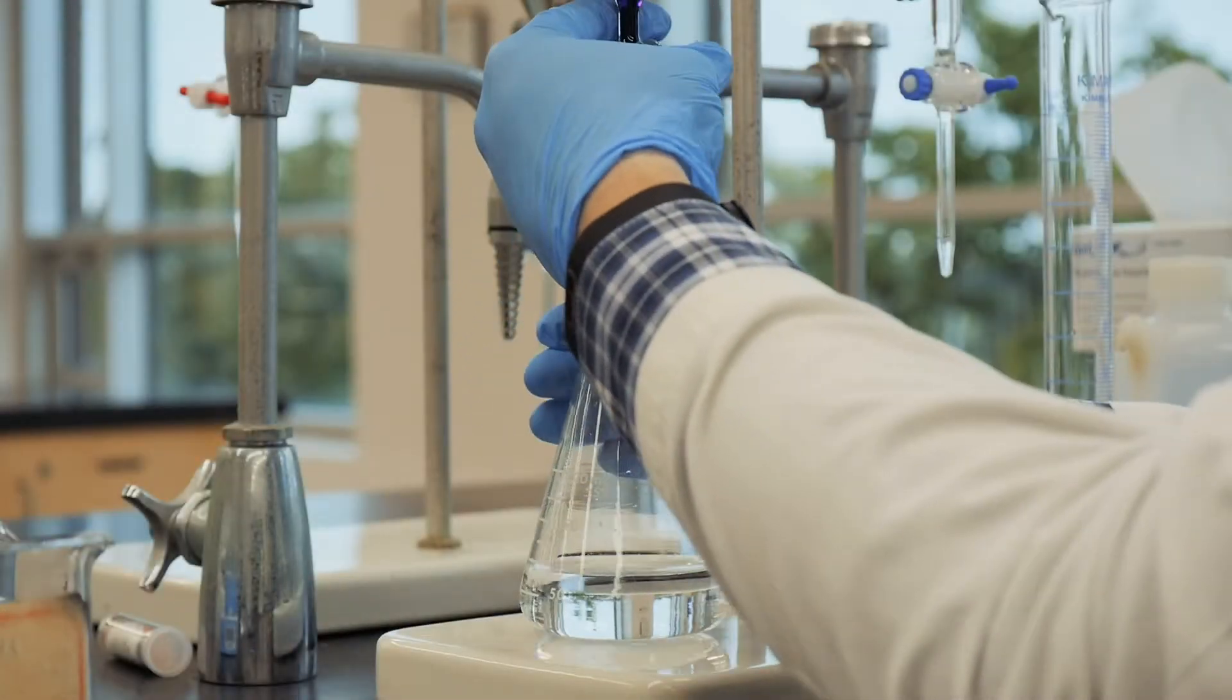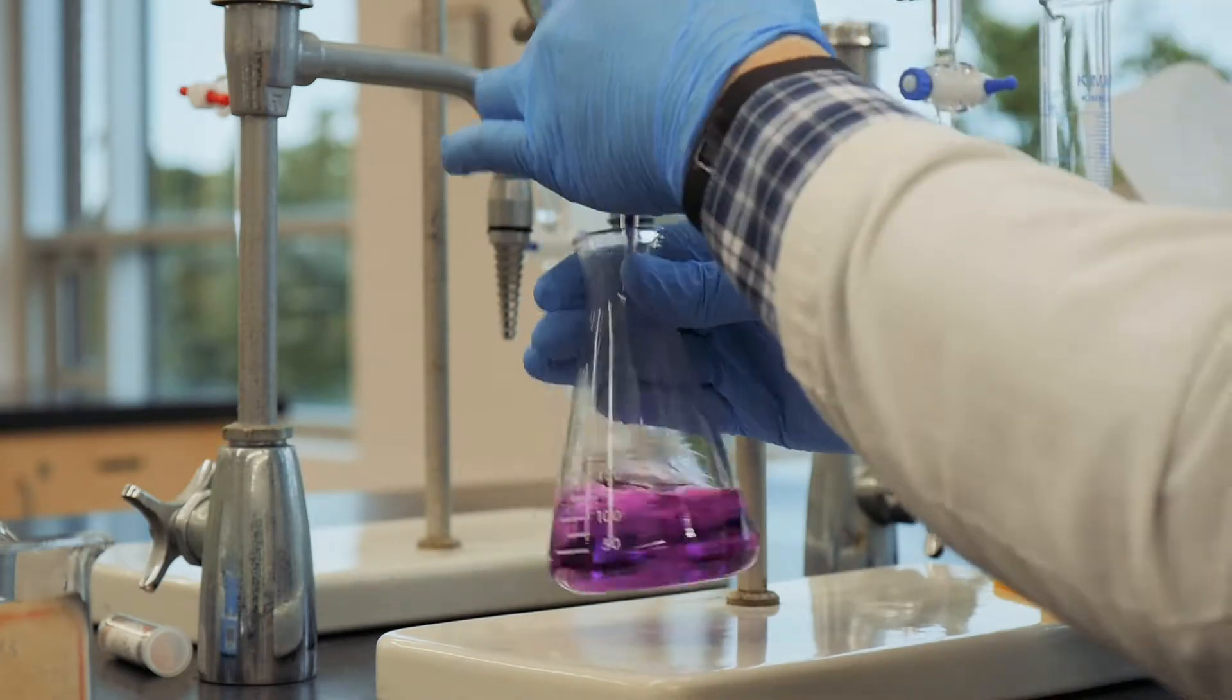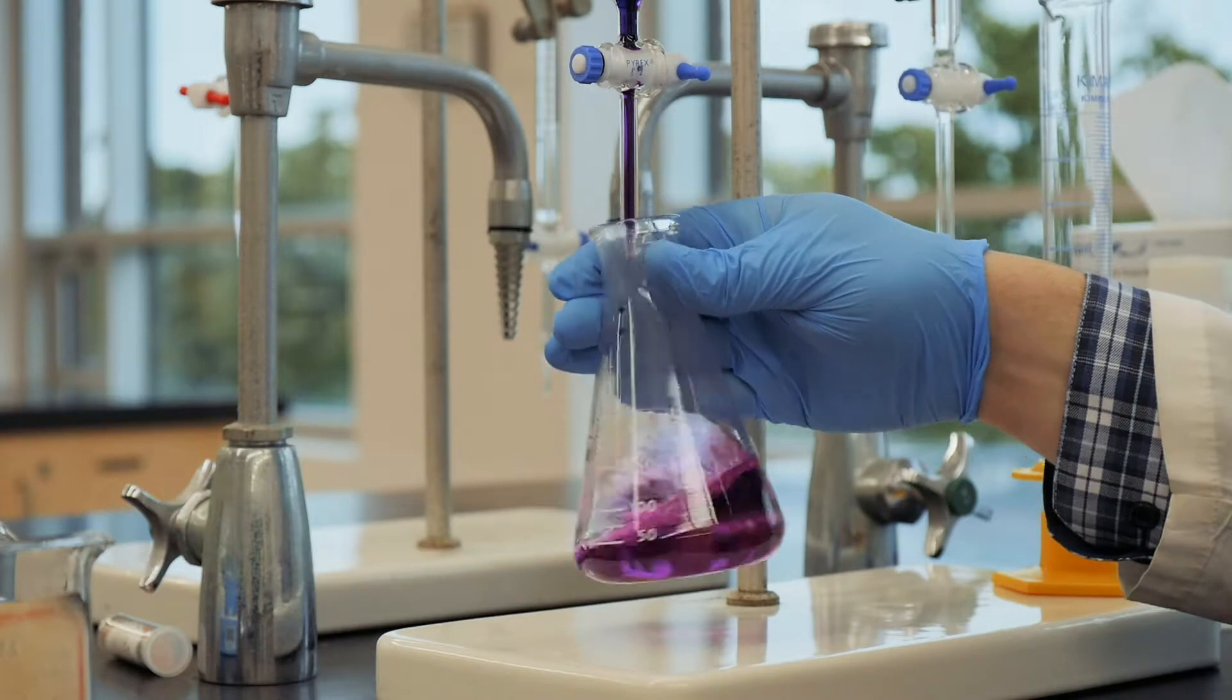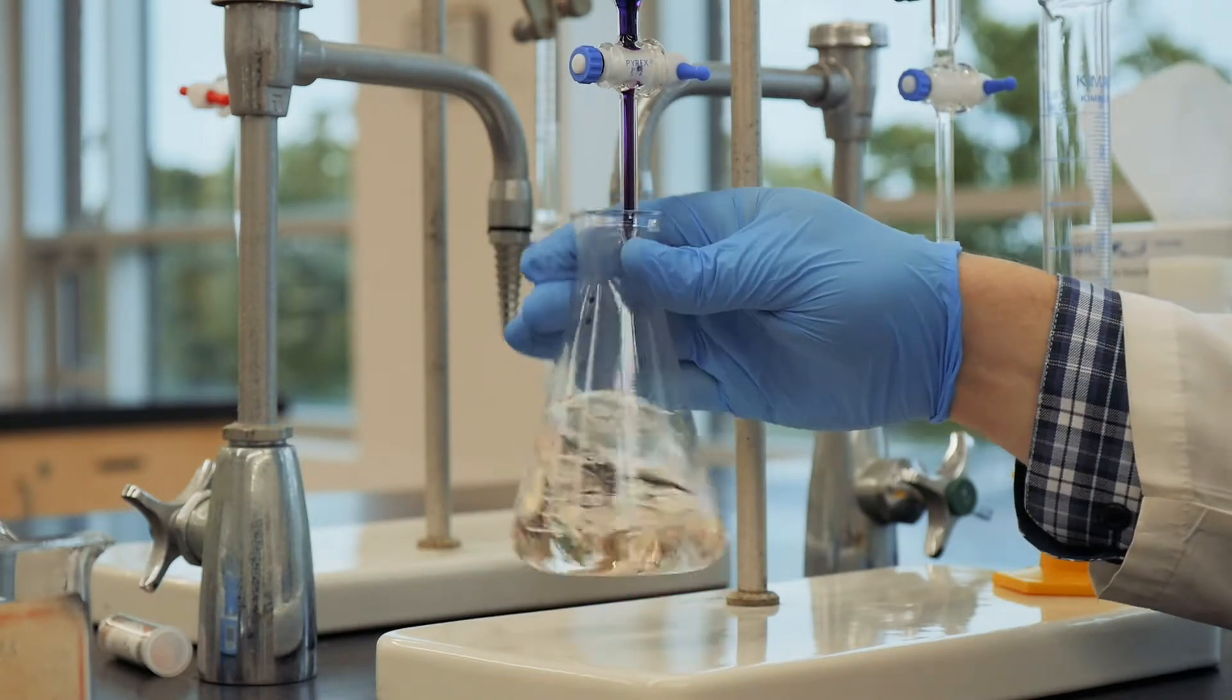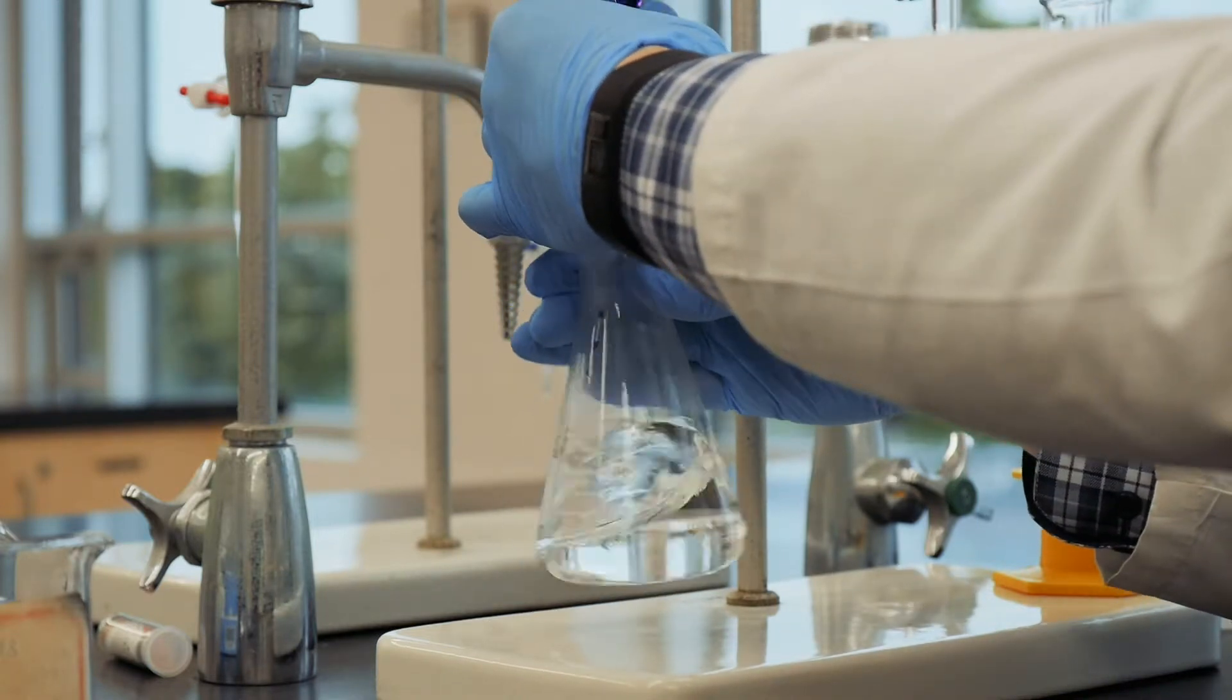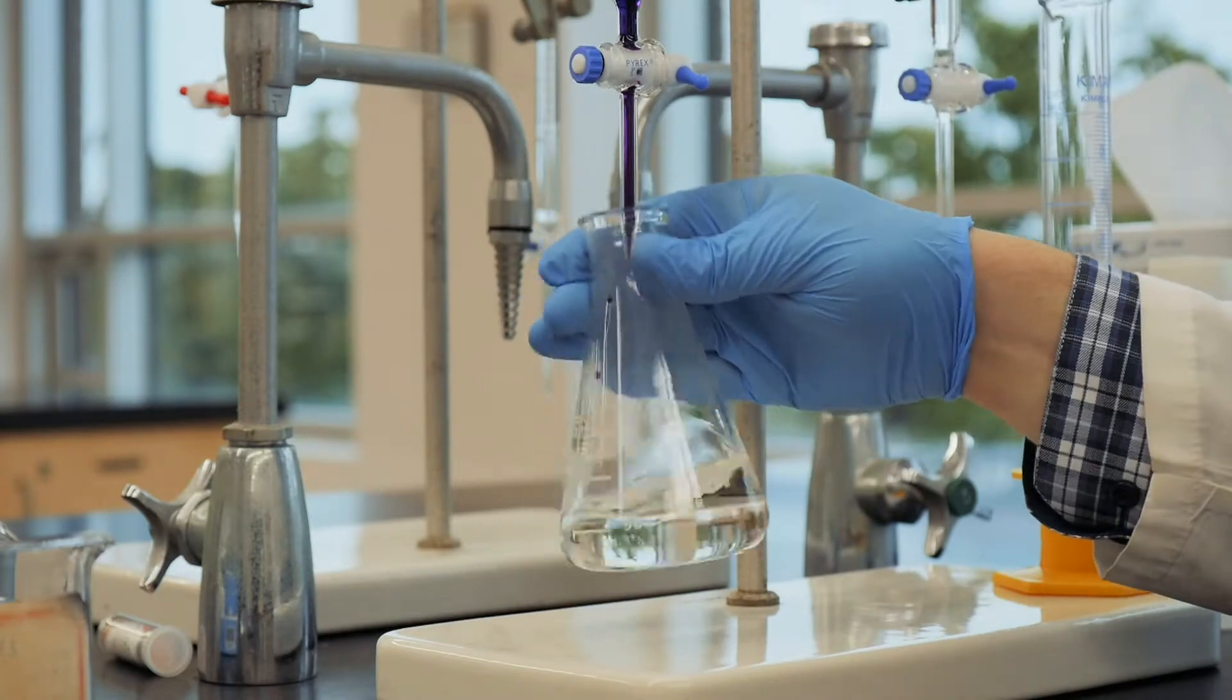Today we'll be carrying out a redox reaction, which as you know, is a reaction where electrons are transferred from one molecule or atom to another. You'll be using a titration to figure out the concentration of an acid called oxalic acid. This experiment is basically just a test of your titration skills, as well as your ability to balance a redox equation and use it in a stoichiometry calculation.